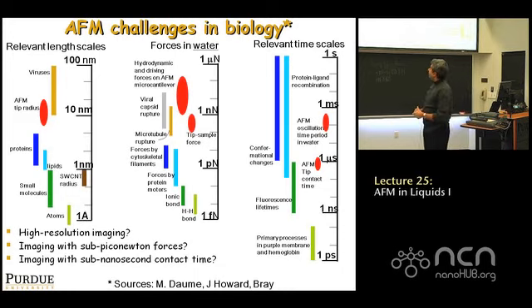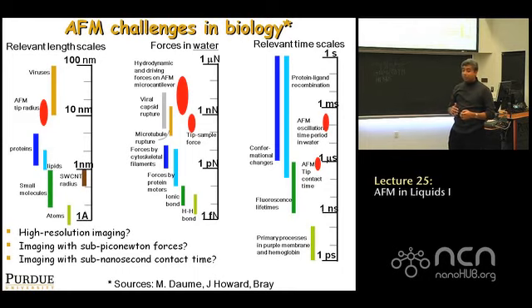If you're looking, for example, at viruses, if you're trying to study individual viruses, when you apply about a nanonewton of force to a virus, it typically buckles and collapses. So the shape and the height that you're observing are not going to be right. Which means that certainly when you try to do things like viruses, you are trying to apply forces that are just a couple of hundred piconewtons, or 0.2 nanonewtons. 1 nanonewton or 2 would be too large for them.